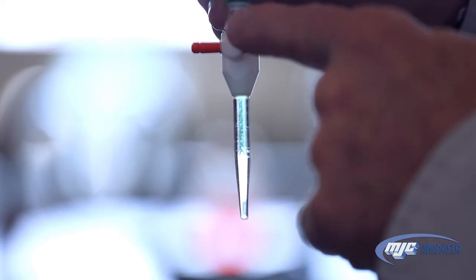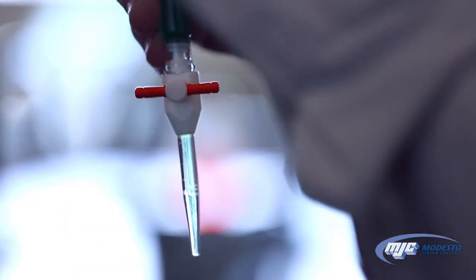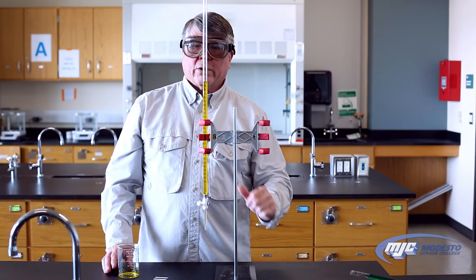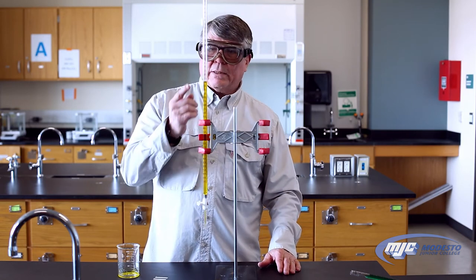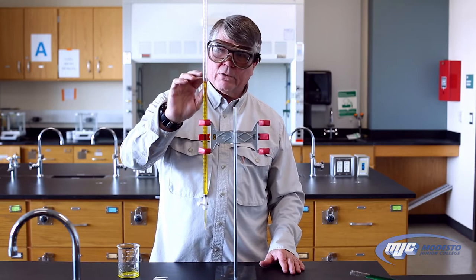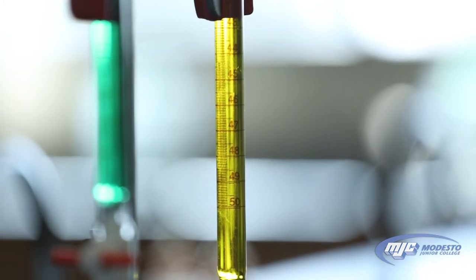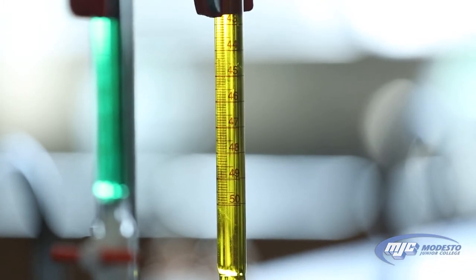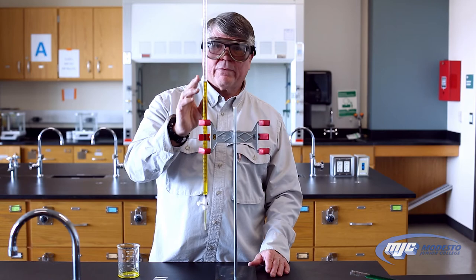With the stopcock, which is right here — it's closed when it's perpendicular to the tip, so nothing can come through the tip. When the stopcock is parallel and in line with the tip of the burette, then it's open and liquid will come out. So we have our solution in our burette, we've cleared all the air bubbles out of the tip. The next thing you need to do is measure your initial volume. With these burettes, the closest marks are 0.1 milliliters apart, which means you will always record any measurement to two decimal places — one hundredth of a milliliter. The units are milliliters, mL.